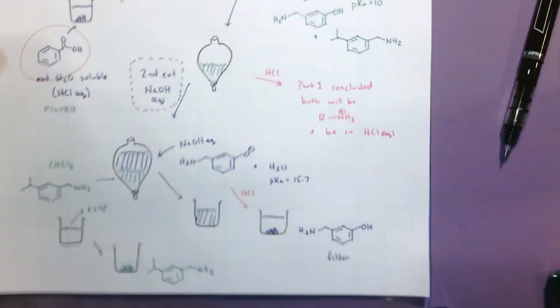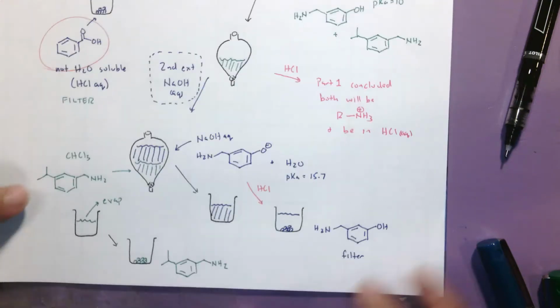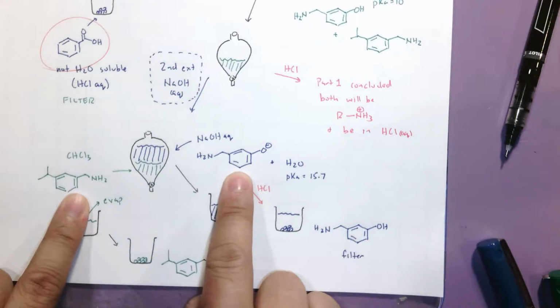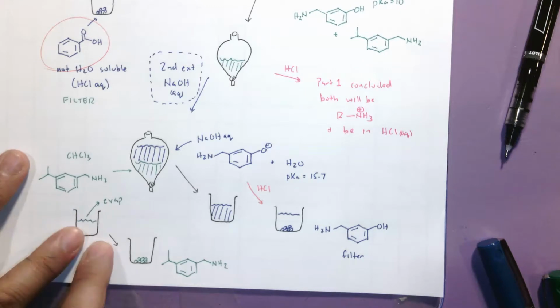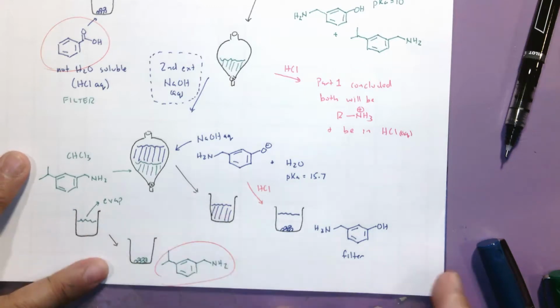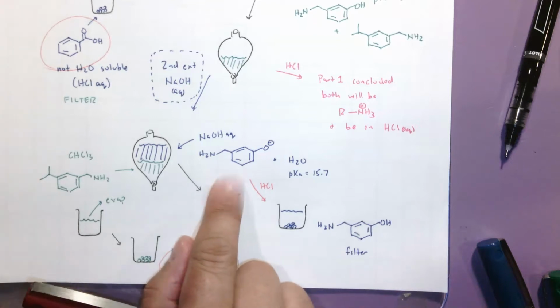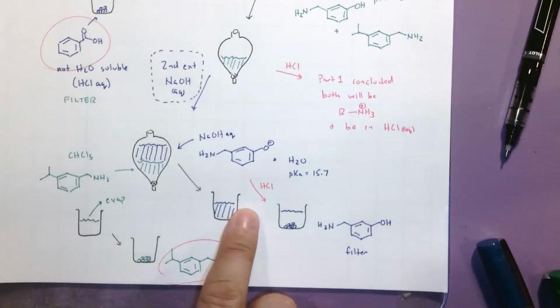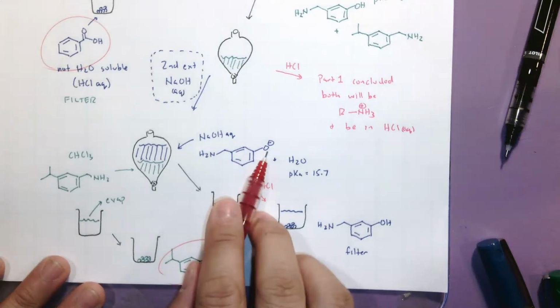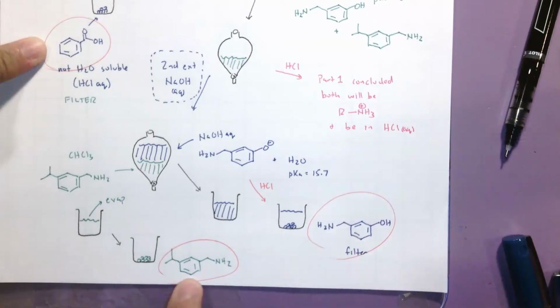If we zoom out even more, there's our first molecule that we isolated. And then we were able to separate these two. This one was never charged, so there's no neutralization. We just have to evaporate the solvent. So there's that molecule. Now this molecule is charged, but I really want these three, I want all of them to be uncharged. So we add HCl, a strong acid that will reprotonate this oxygen, and we filter. Those are your three compounds circled in red, 1, 2, and 3.